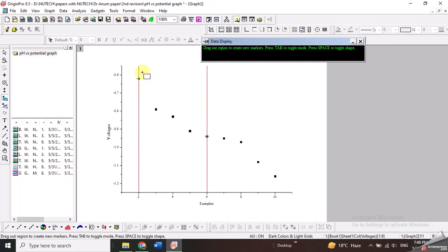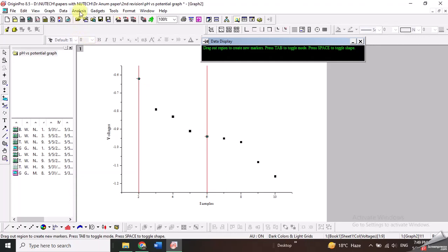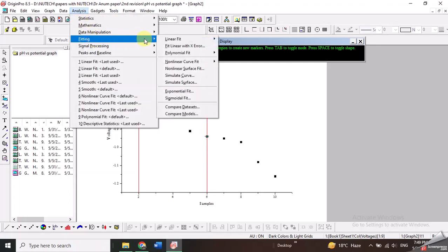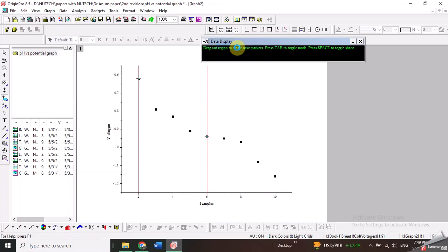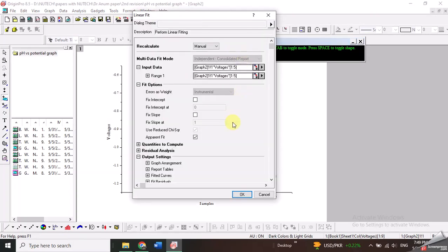Then I will go to Analysis, Fitting, Linear Fit, and open this dialog box. Here I have certain options like I can fix the intercept or fix the slope, but in this case I don't need to fix the intercept or the slope.